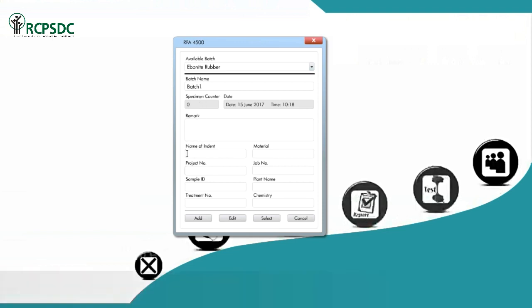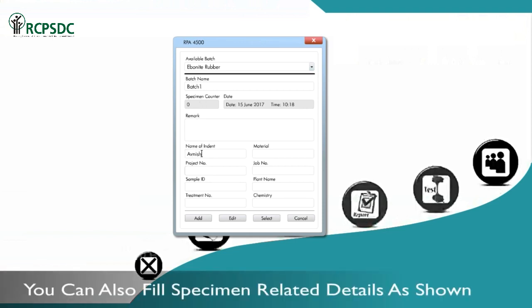Fill in the batch identification with other details such as date of production, internal mixer on which it produced, etc.